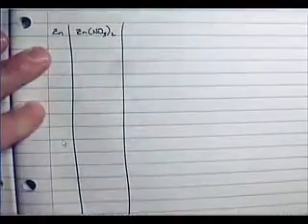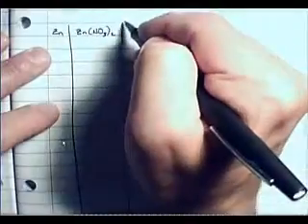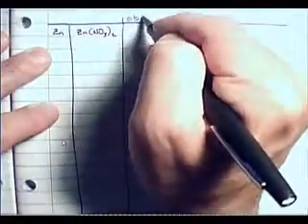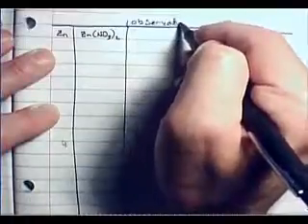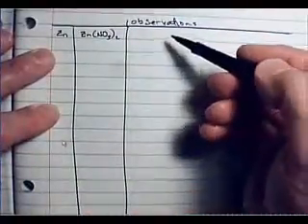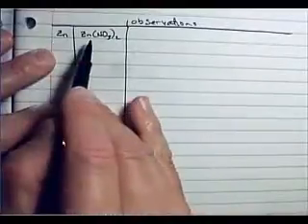Okay? And so that's going to make two columns. All right? And so we had a column, the next column was for observations. So I have observations here. So here is where in the lab and during the lab, you're going to put your observations when you put zinc and zinc nitrate. Okay? That's what you're going to do in the lab.